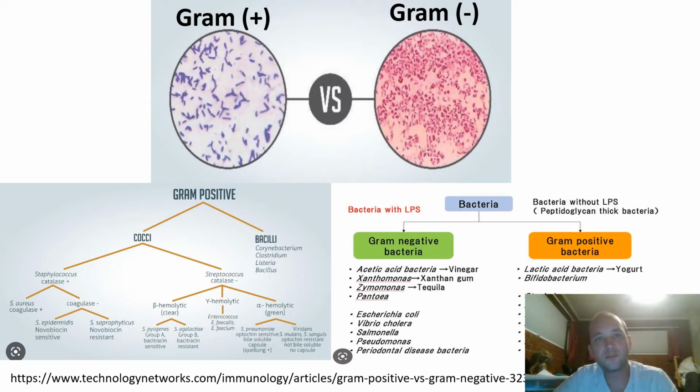A patient will sometimes present with signs and symptoms of a bacterial infection, but the care provider may not be convinced that it truly is bacterial. It could be idiopathic, caused by the immune system attacking itself. It could be viral. It could be many other things besides bacterial. A timely and accurate gram stain first confirms for the care provider that bacteria is present in the suspected infection. Second, with a gram stain result, the diagnostic technician can do tests to hopefully identify the bacteria to its genus and species level.